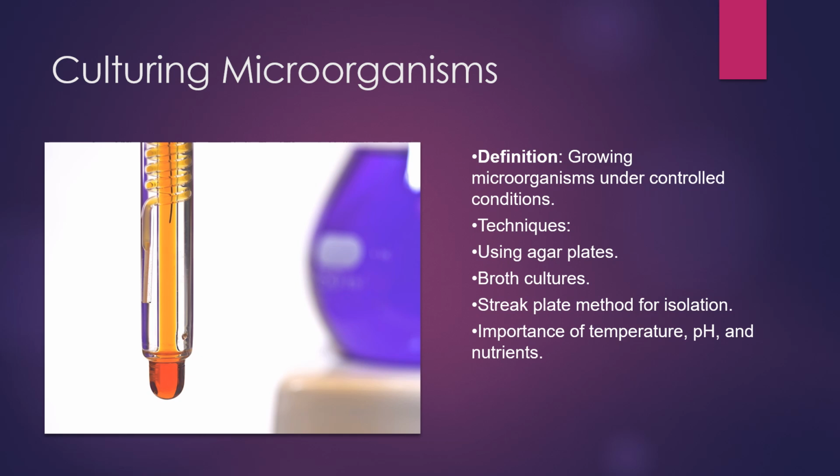And if you're wondering what agar is, essentially seaweed, extracted from seaweed. It's a jelly-like substance that you can inoculate with various different nutrients and make a certain level of pH that is favorable for bacteria you wish to grow.